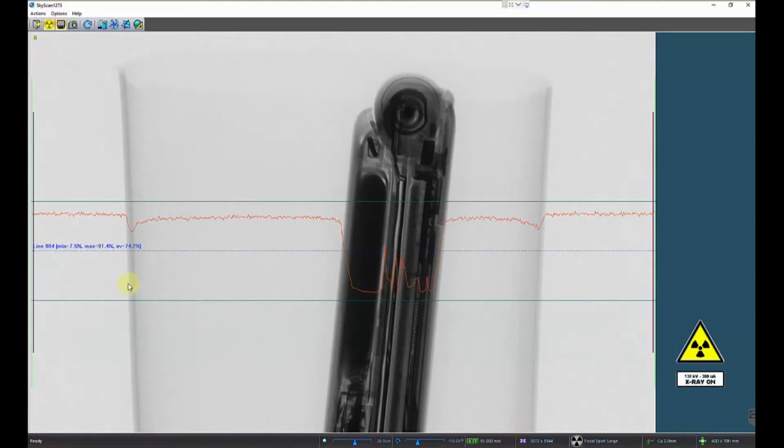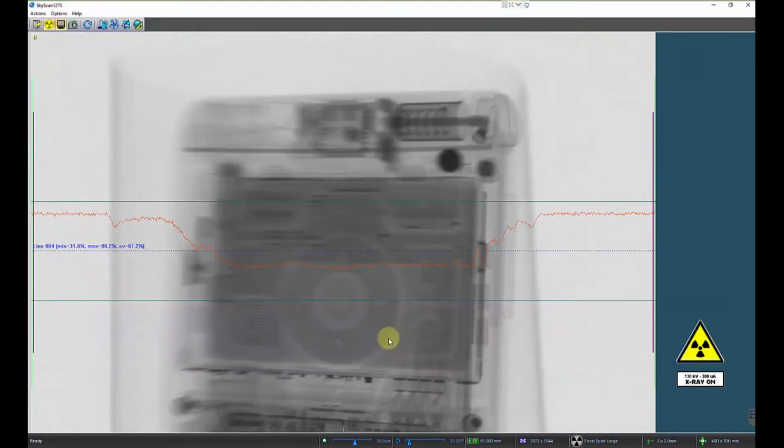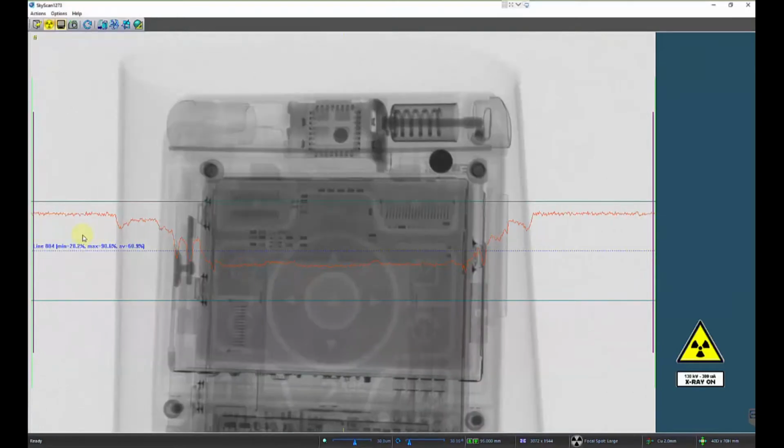So even though we're only at 8% here, if we go ahead and rotate the sample back to a thinner view, we'll see that in other views of the collection, we're going to have about 30% transmission. So while we would love to have 20% or 40% transmission through the whole sample, for some sample types like this one, where you have a really high aspect ratio and really dense features, that may not always be possible.